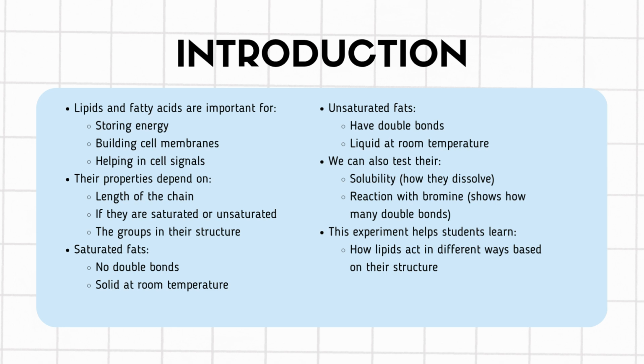We can also test their solubility, how they dissolve. Reaction with bromine shows how many double bonds there are. And this experiment helps students learn how lipids act in different ways based on their structure.